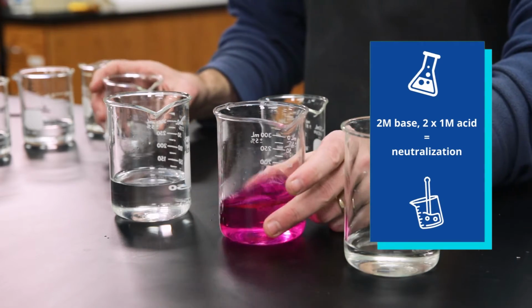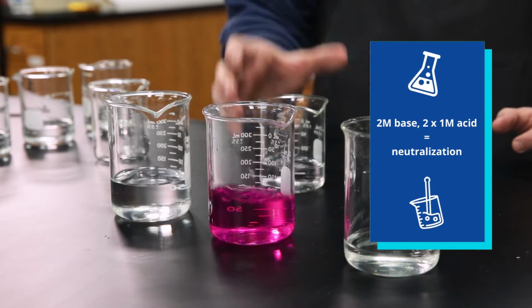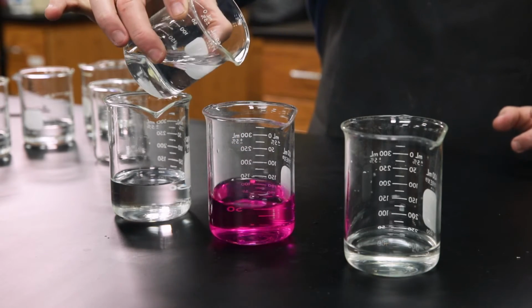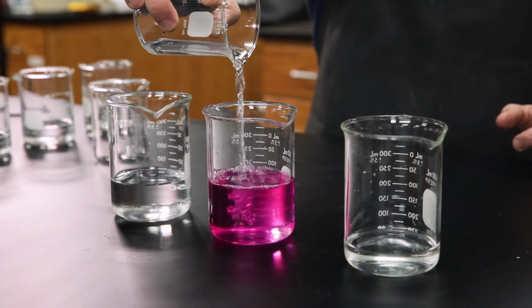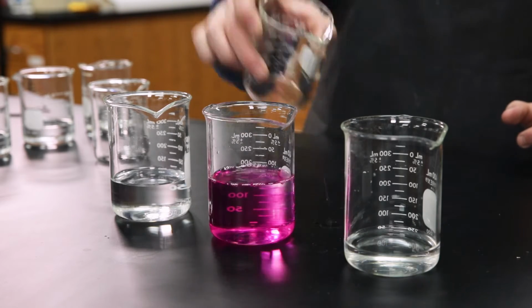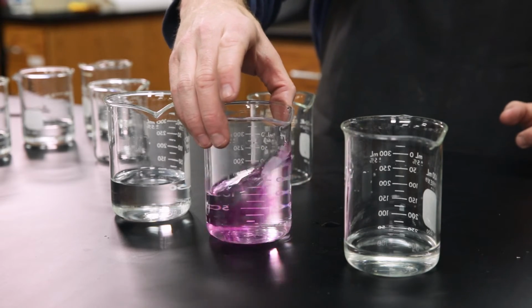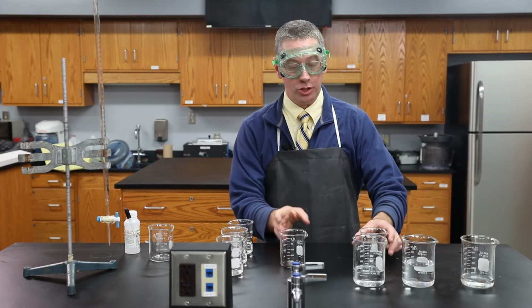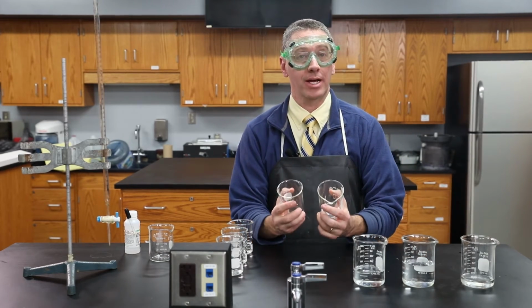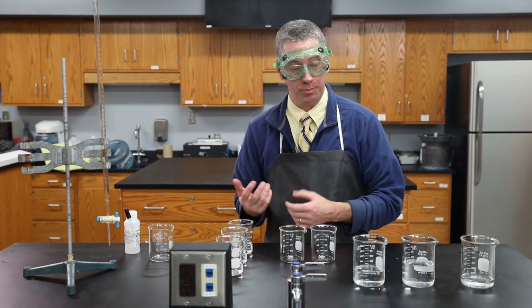So there's the first beaker, but if I swirl this around, you'll notice the color change is going to go away. Only when I add the second one. Right now it's still basic. And we were able to neutralize 2 molarity base using twice as much 1 molarity acid because you have to get the number of OH minuses to match the number of H pluses.